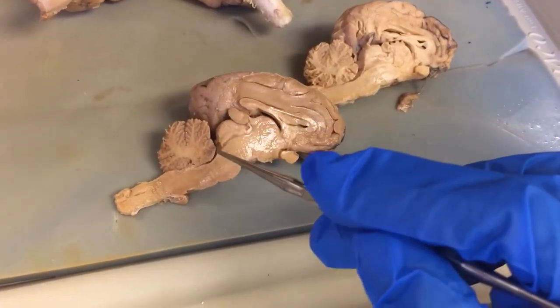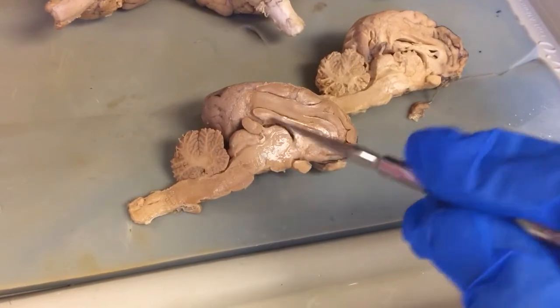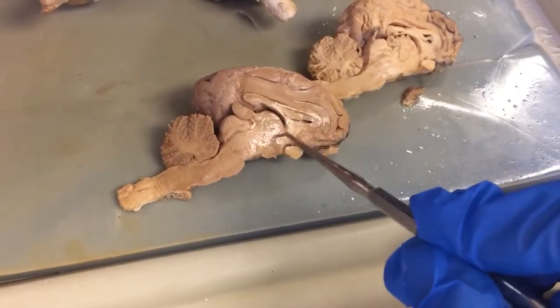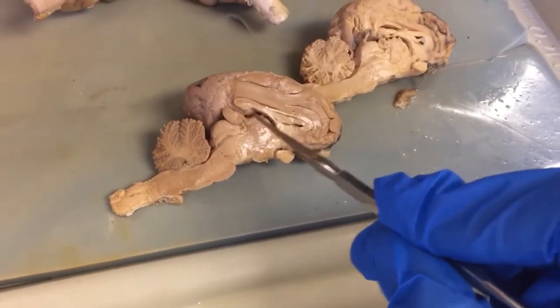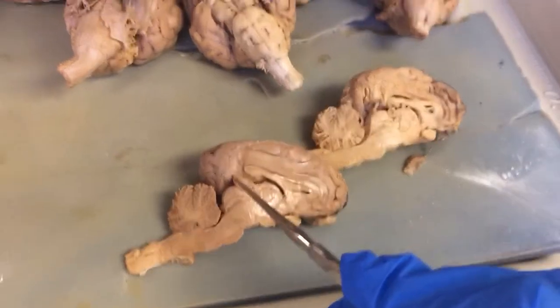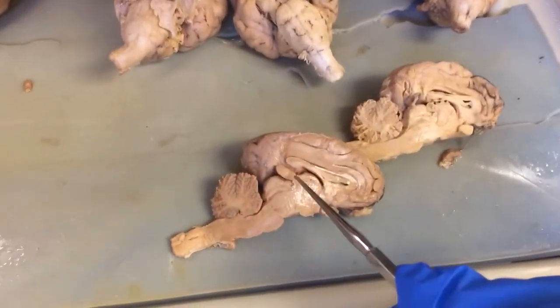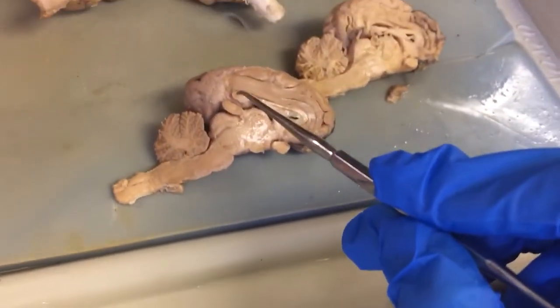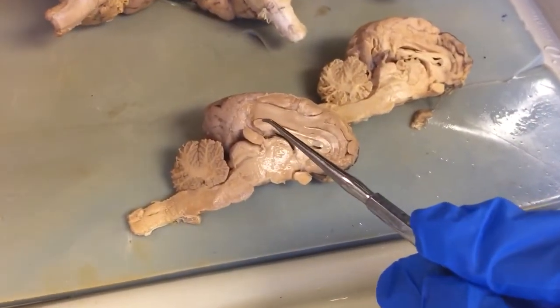All right, so then we're going to go back here. Some other important structures. Just behind this corpus callosum, you have this big round intermediate mass. Okay, and then this part is the pineal gland here. So remember back to when we did the lamprey and there's that third eye, kind of a white spot between the eyes on the top of the head. That was the pineal gland, right?